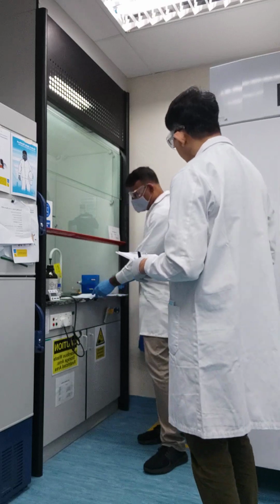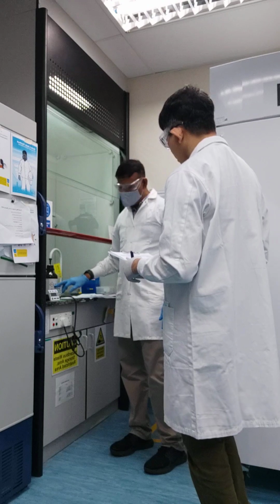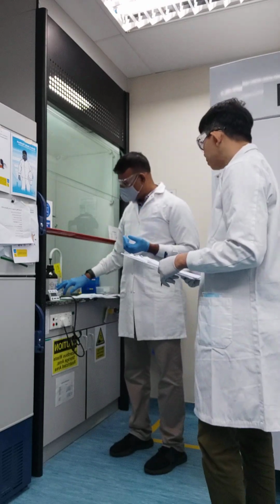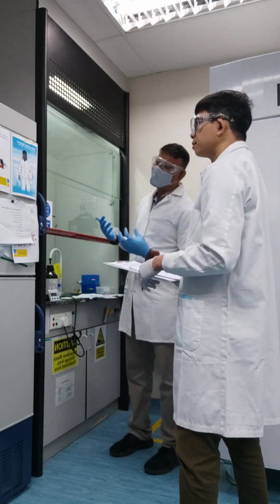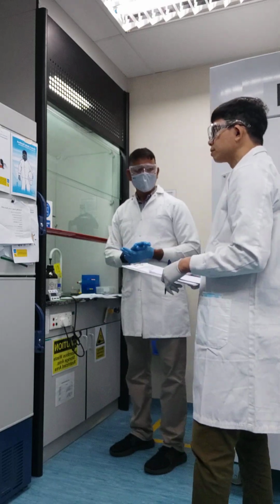Right. Alright? And then thirdly, you also look at the physical hazards by recognizing the symbols. In terms of this chemical, we know that it is corrosive in nature and also it's an irritant. Alright? Is that clear? These three steps?